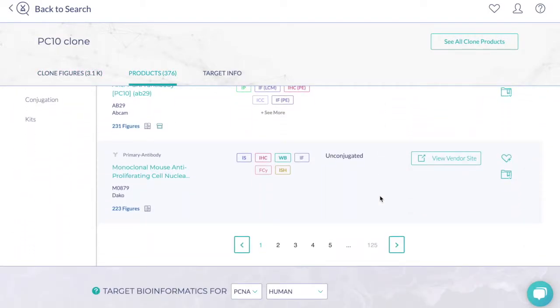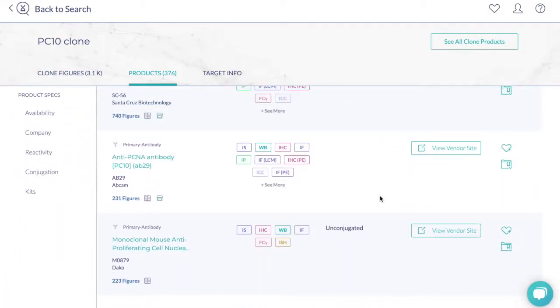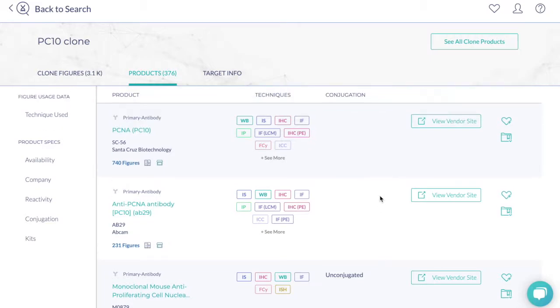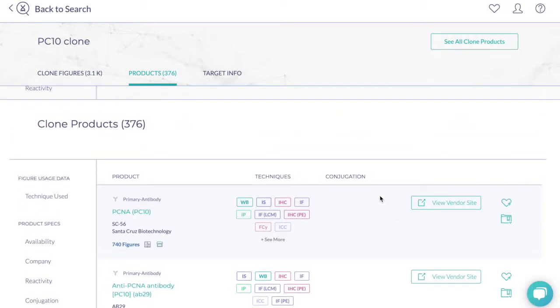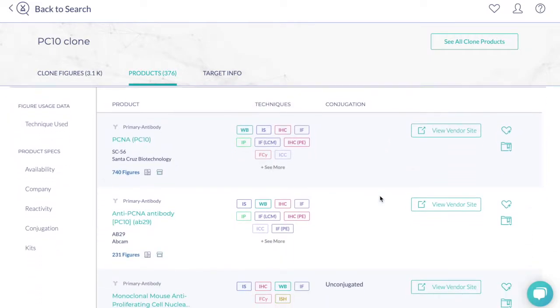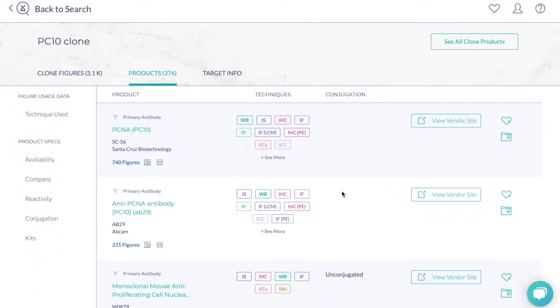Here, you can narrow down the results based on what's important to you. For example, a preferred vendor or a particular conjugation to find the most suitable antibody produced by this clone.